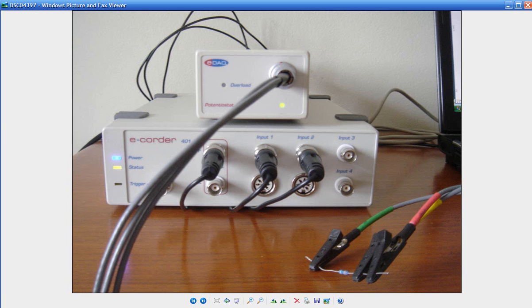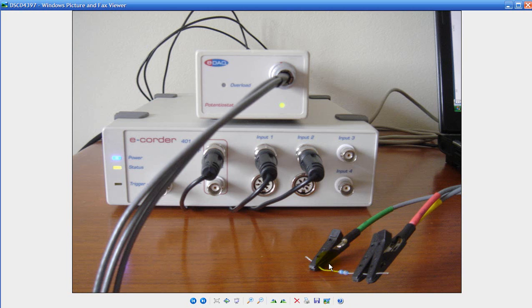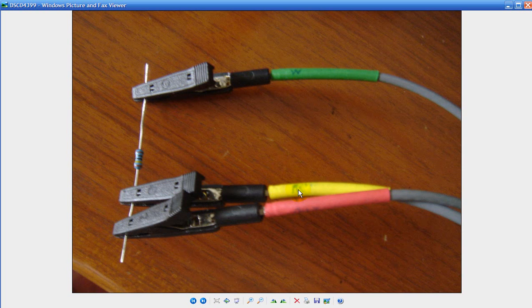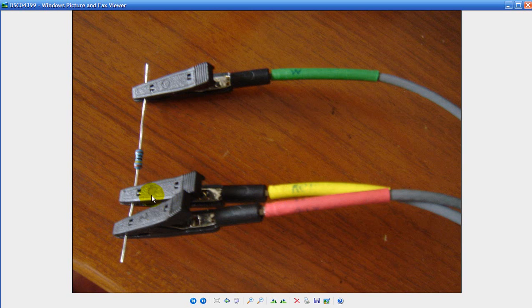You need to connect the potentiostat to the E-corder as normal and then connect the electrode's cable to a resistor. In this case I've chosen a 1Mohm resistor. You connect the green working electrode to one side of the resistor and the yellow reference and red auxiliary electrodes to the other side of the resistor.